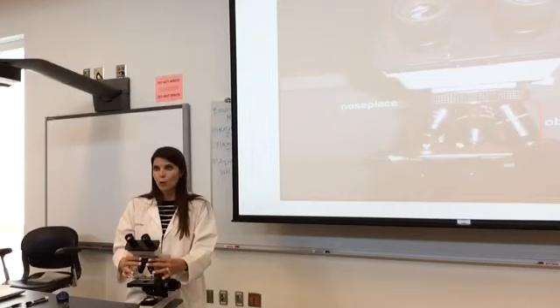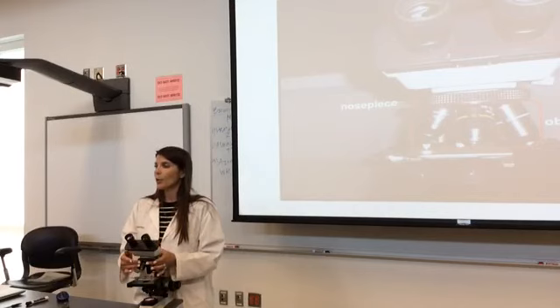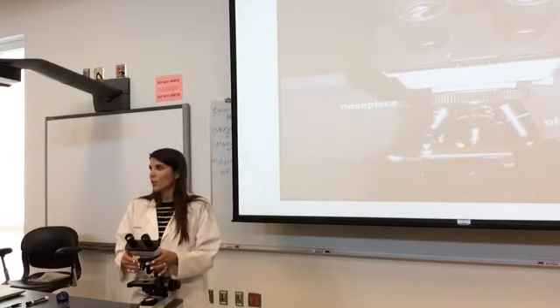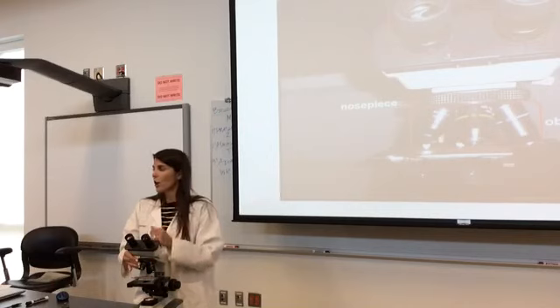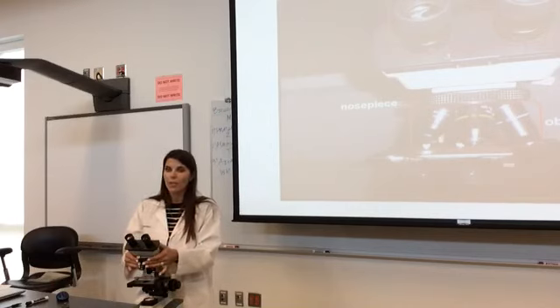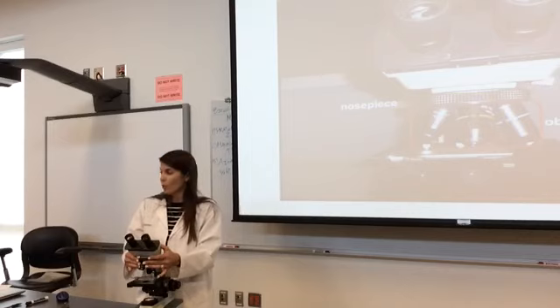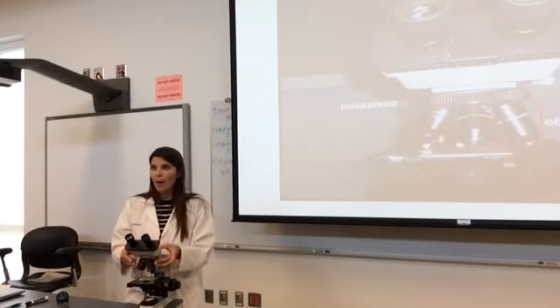If you roll your nose piece over to the yellow one, with the yellow band, it has the number 10. This is what we normally call our medium power objective. Okay? It magnifies 10 times. My oculars also magnify 10 times. So any specimen viewed on the medium power objective is magnified 100 times. Fantastic.